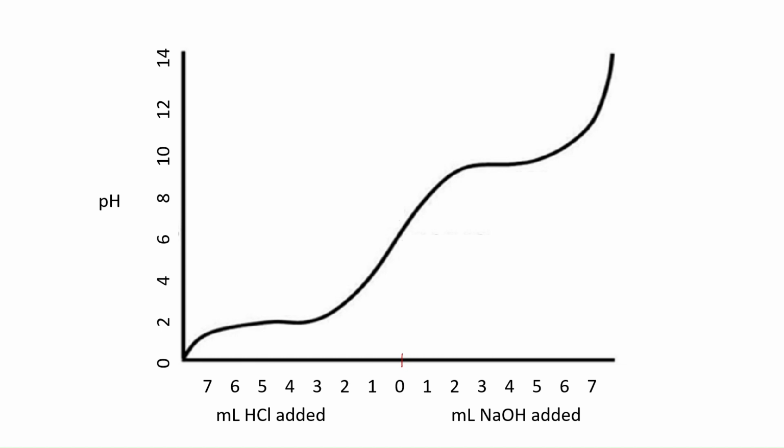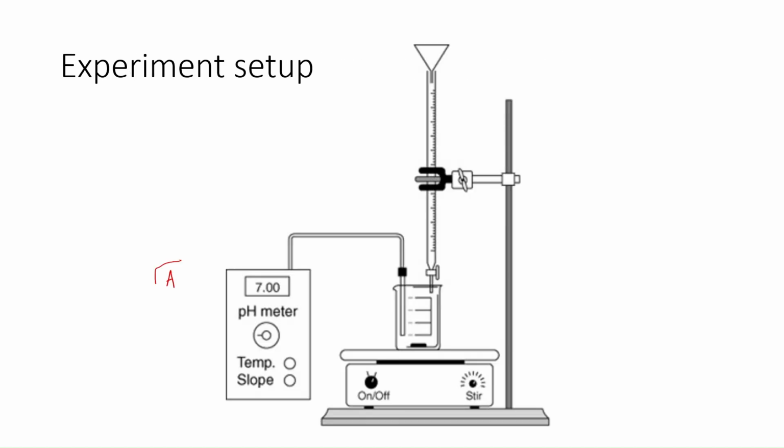And I also want to make one other note, actually from a couple slides back. I apologize for forgetting this, but when you're dispensing your titrant, you're dispensing it drop by drop, and you're looking for pH changes. You're making recordings of the pH change about every 1/2 of a pH unit. So sometimes, depending on this titration curve, which we're just about to talk about, adding one drop might change the pH a lot.